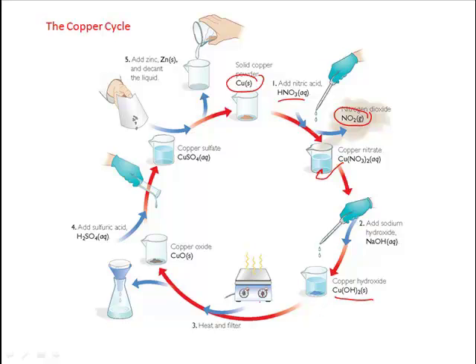After we heated it up, it changed colors from a bluish lumpy stuff to a brownish black goop, for most of you. Few of you actually in this step got a bluish colored goop, this solid. And we'll try to explain why that could be. We added sulfuric acid to it and it turned light blue again, which was the copper sulfate.